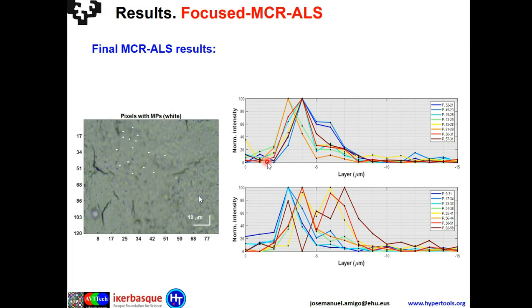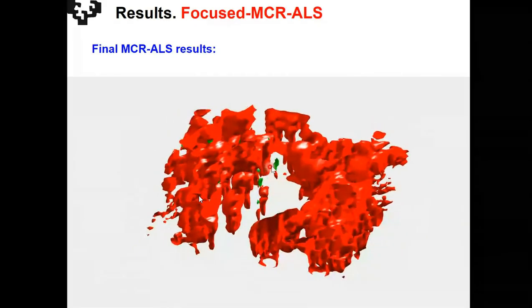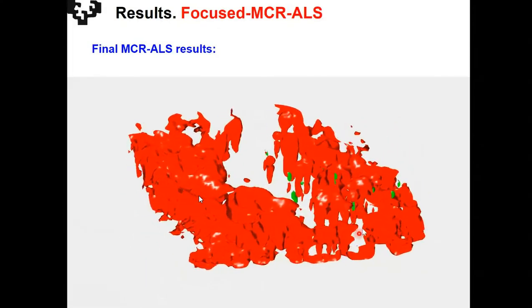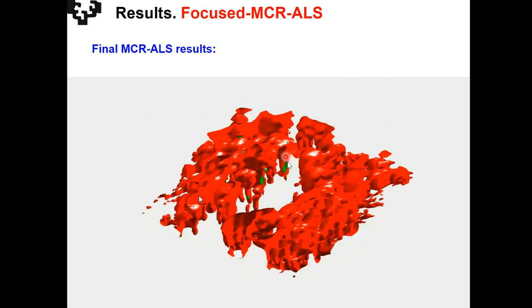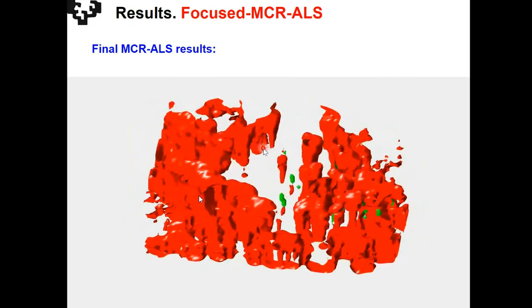But it is also telling us that this plastic is not on the surface, so it cannot be a cross-contamination. Together with the fact that we took this signal and were able to create this 3D video in which we could see the plastics in green. The red is the meat, the tissue of the muscle, and here in the middle we have a hole. That hole is the stomach. And the stomach is fine to find microplastics. It's not fine, no? But it's logical to find microplastics.